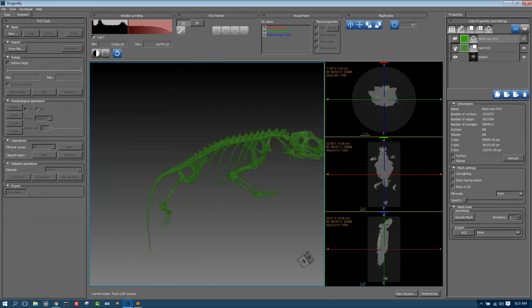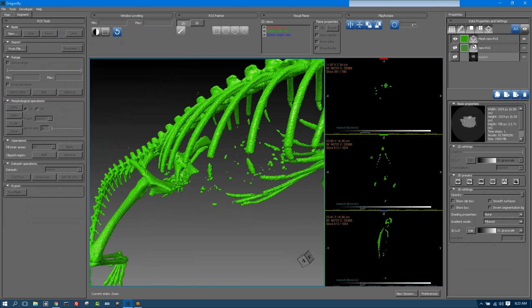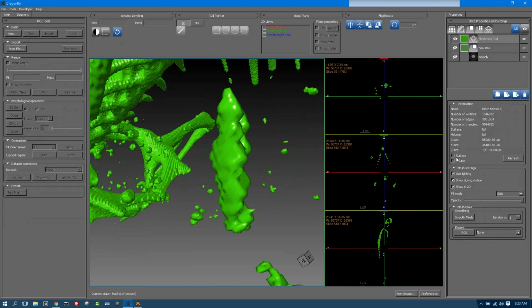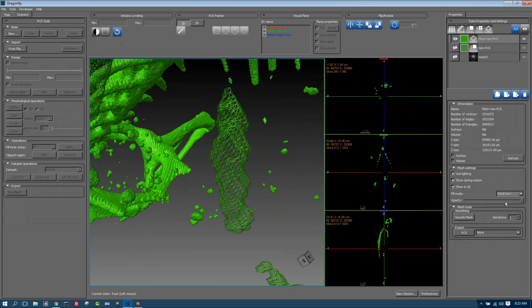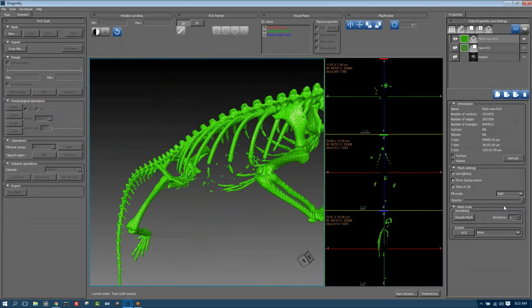So let's turn off everything except a mesh rendering. If you zoom in really, really closely, you'll see individual triangles. I think even in this view, we could tell it to show the rendering as a wireframe, and now you can see this is just a collection of triangles if you zoom in high enough. So inside the user interface, you see I've got my image, my segmentation, and now a mesh.